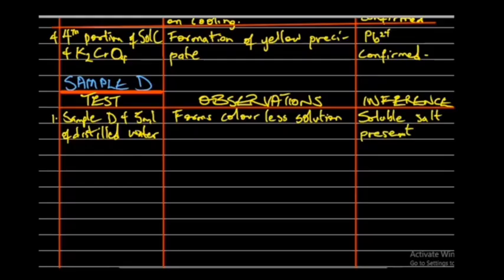Then we carried out another test using litmus. Solution D plus litmus.